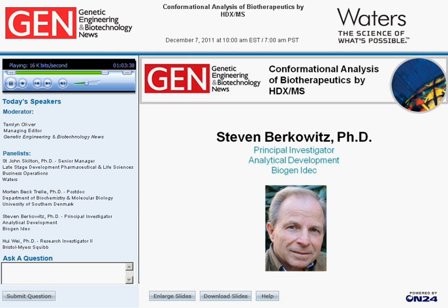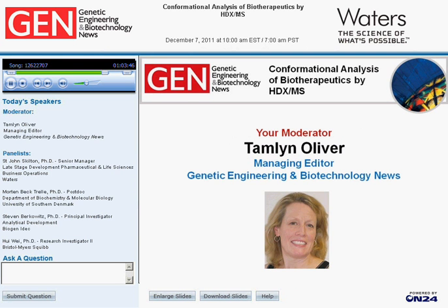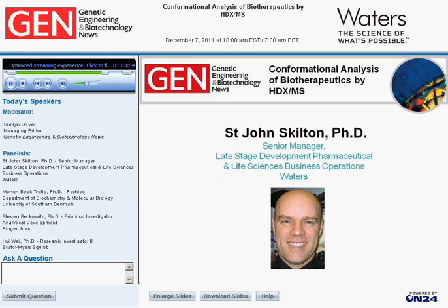St. John, we have a bunch of questions for you right now. The first one is, what do the FDA and European and Japanese regulatory authorities think of HDX? Well, I can't necessarily tell you what they think because that's sometimes a private conversation between themselves and the people who submit it. But we do know that the regulatory authorities have received HDX data and have looked through it. So it's a reality now. Don't forget the regulators are very careful to say that it's up to the submitter to explain why they're doing it and what they interpret from it.